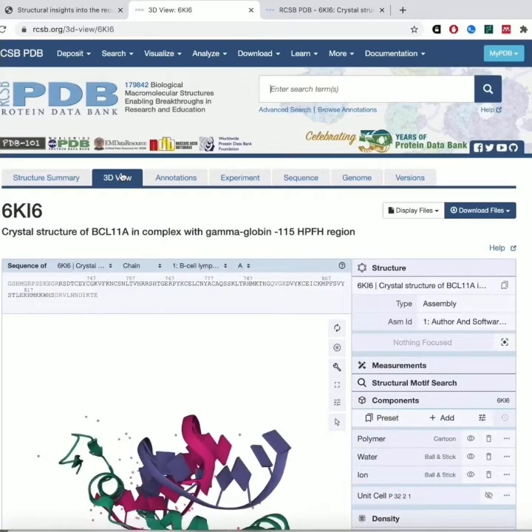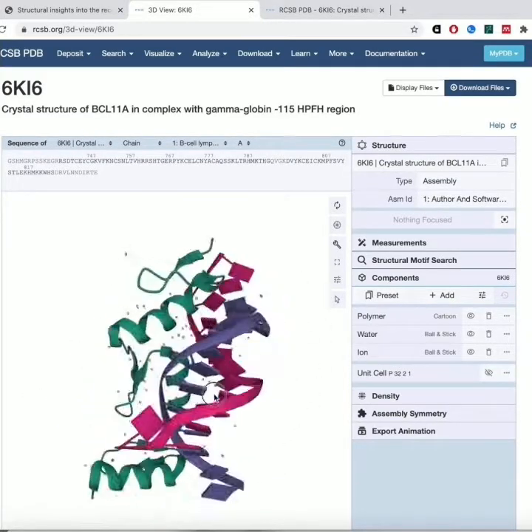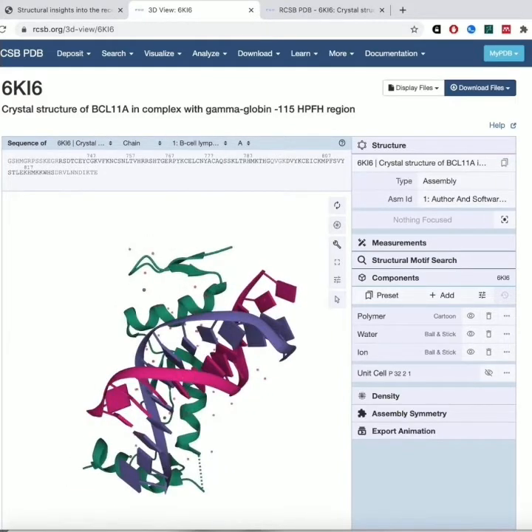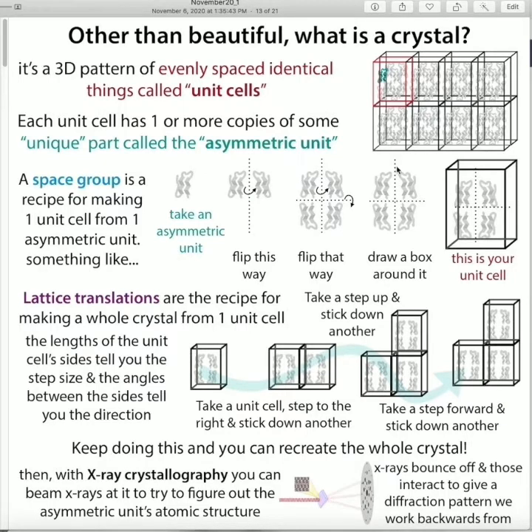If you go to the 3D view, this is where you can see the structure in 3D and play around with it. Right now what you're looking at is the biological assembly, which is like the basic functional unit — the form you would think about when thinking about the protein. When we talked about the crystal being a repeating pattern of brick-like things, those bricks would be your unit cells. Within the unit cell there can be multiple copies of the protein or the complex.